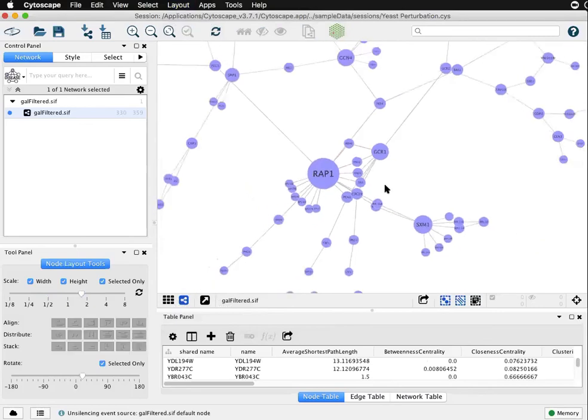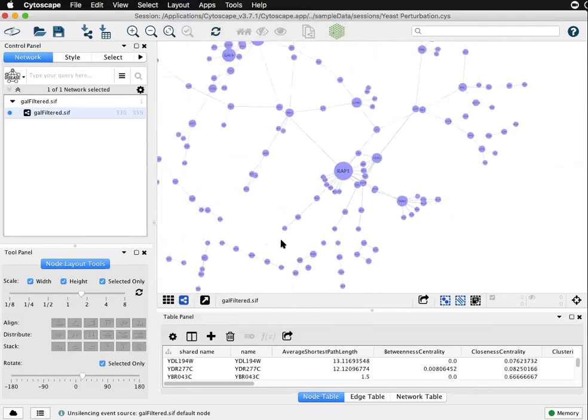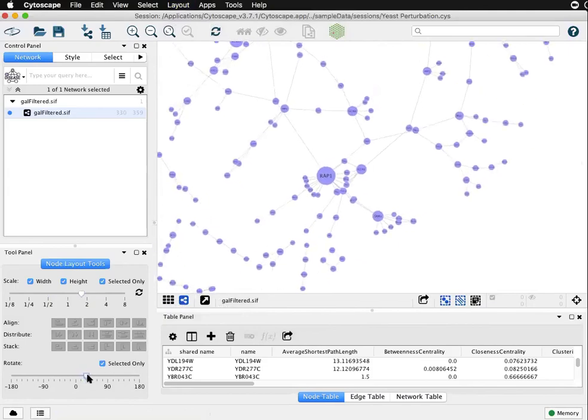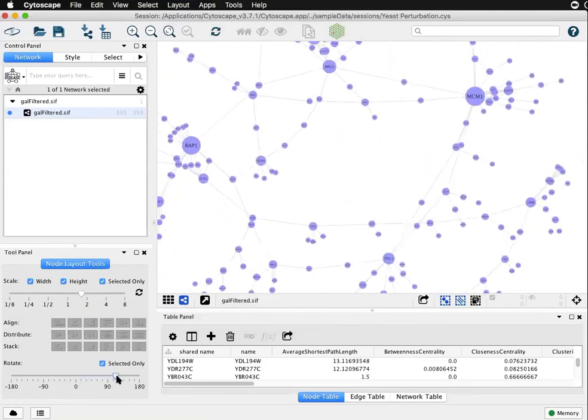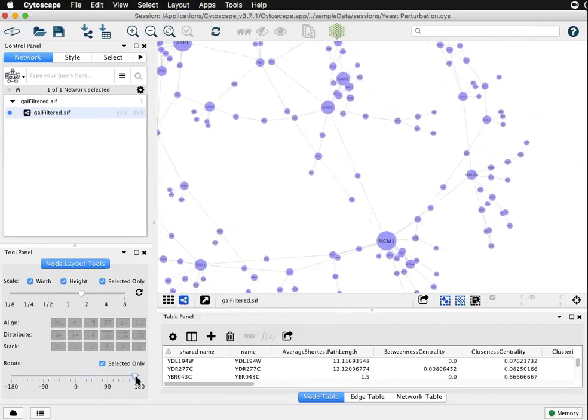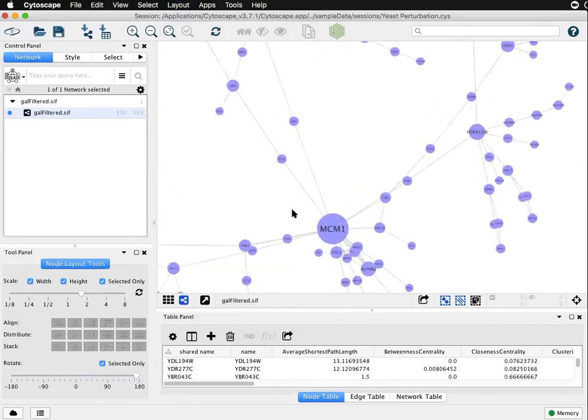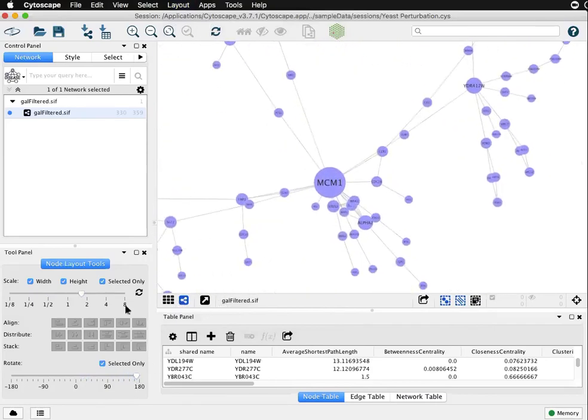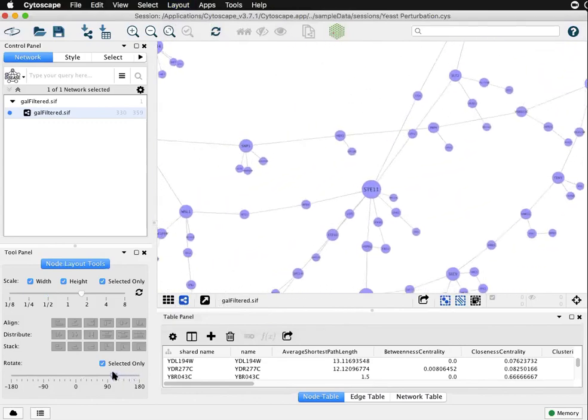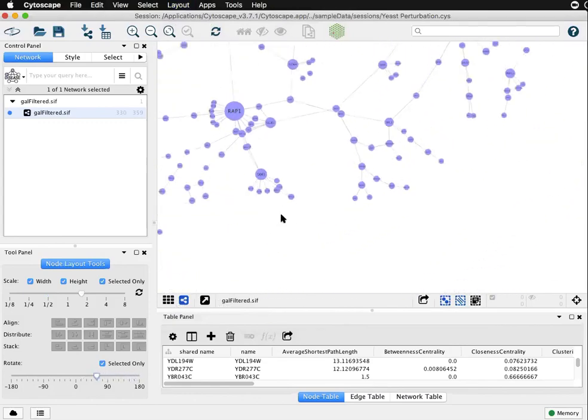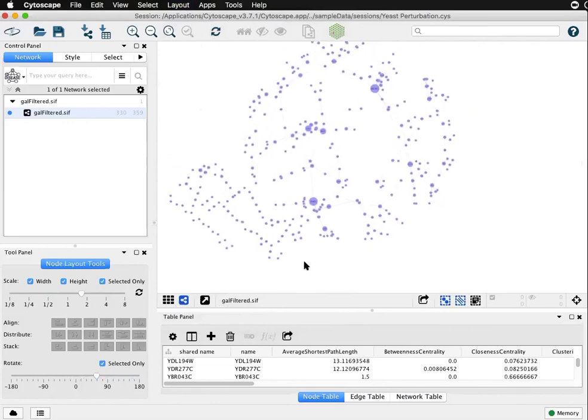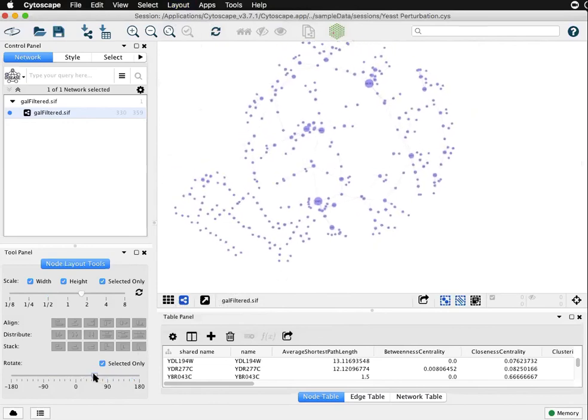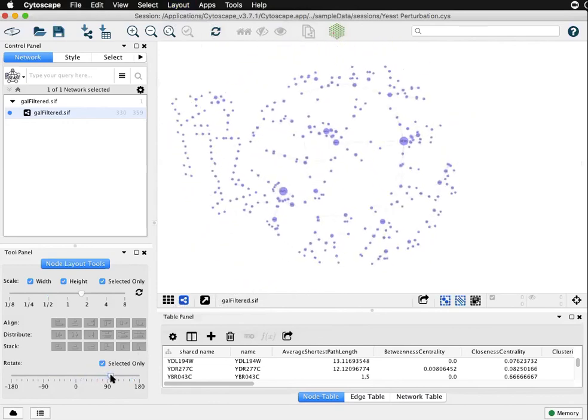If I zoom out again, another nice feature is rotation. This will let you rotate the entire layout, but very importantly no matter how you rotate you'll notice the labels are staying horizontal to maintain legibility. So that's a nice way to fit a network into a portrait or landscape format depending on what you're looking for.